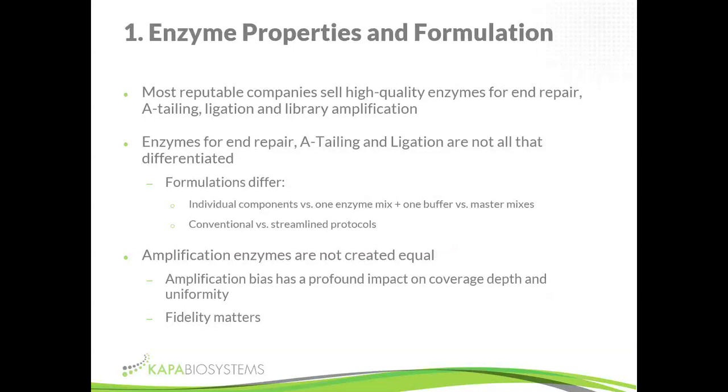What's very important is that amplification enzymes are definitely not the same. Enzymes for end repair, A-tailing, and ligation are pretty much similar between kits, but amplification enzymes are not the same. Amplification bias has a huge impact. We all know that PCR is not perfect, that PCR enzymes struggle with AT-rich and GC-rich molecules, and it's less important when we do traditional PCR.